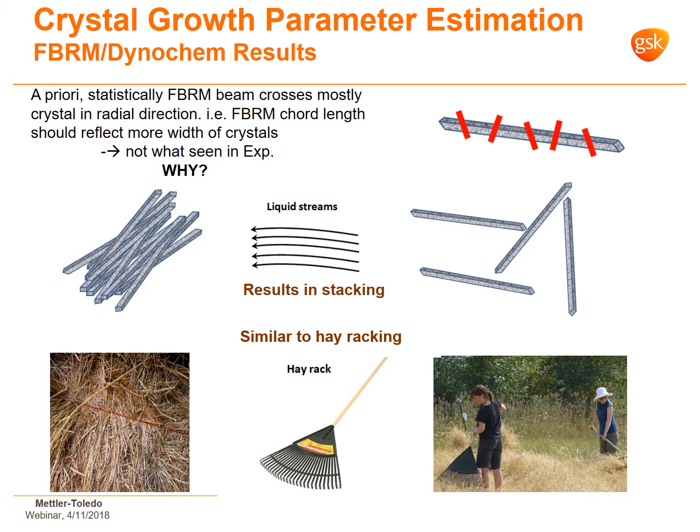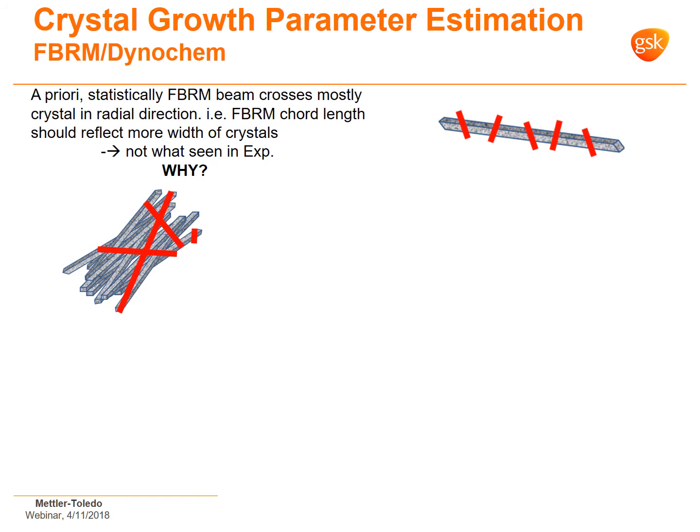Envision it similarly to hay stacking. You know, if you come from a farming family like I do, this is very often the case. So it's very easy. You can stack hay using a rack, and it's something very similar, we think, to what's happening with needles in solution, especially if you're in laminar or transitional flow.